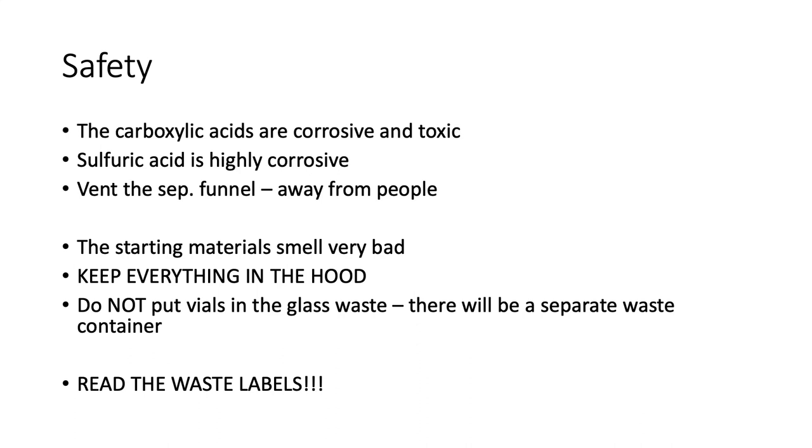And then you want to vent the sep funnel, like we said, away from people. So if you're working in a hood with someone, make sure that they're not around. Don't turn around to talk to somebody and point it in their face. The starting materials smell very bad. Your product will smell really nice, but it'll still smell a lot. So keep everything in the hood. This is a very, very smelly lab. Even if you keep everything in the hood, if you're walking by whichever bay is doing this, you will know. So we want to limit the amount of fumes that get out into the lab. Keep everything in the hood.